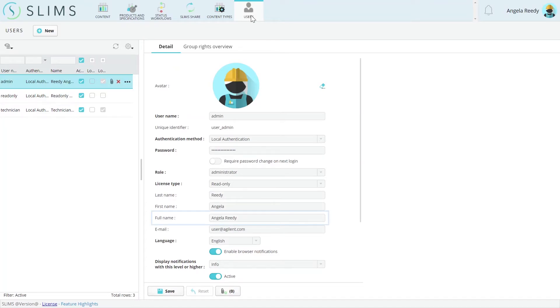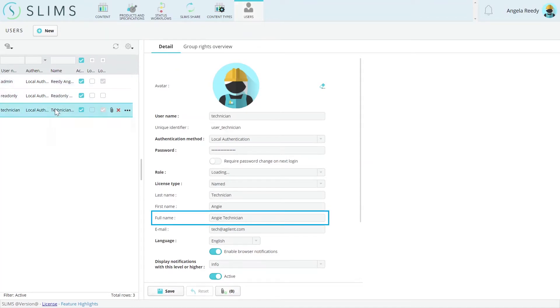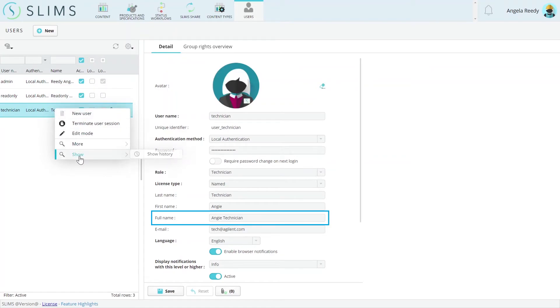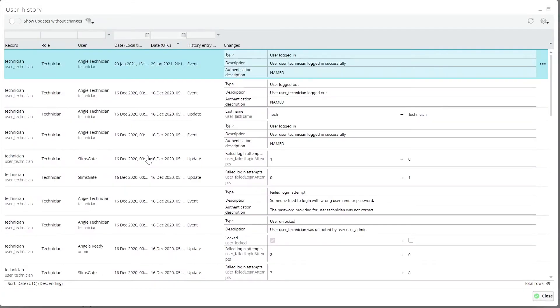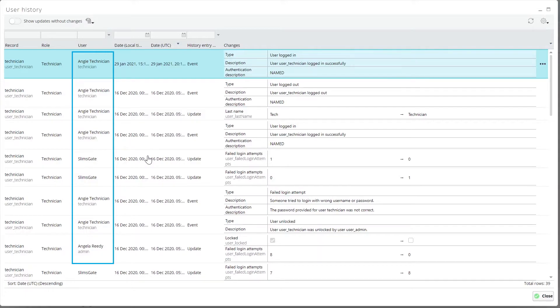Finally, in the user's module, the full name field was added, which automatically concatenates the user's first and last name fields. Slims does this even if the user's name data is coming from a third-party authentication method whenever possible.